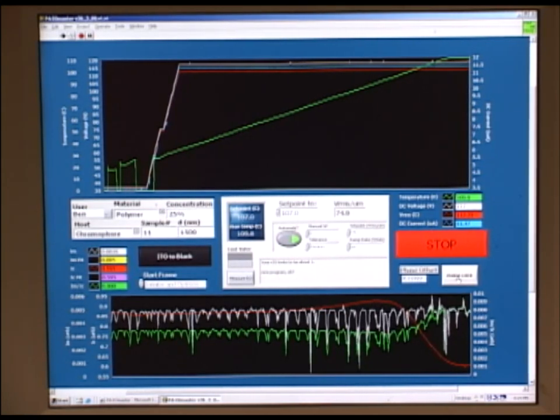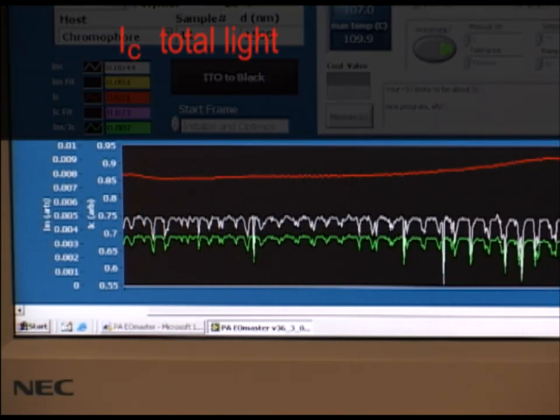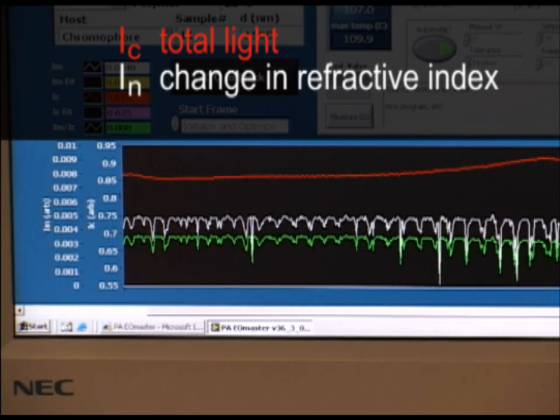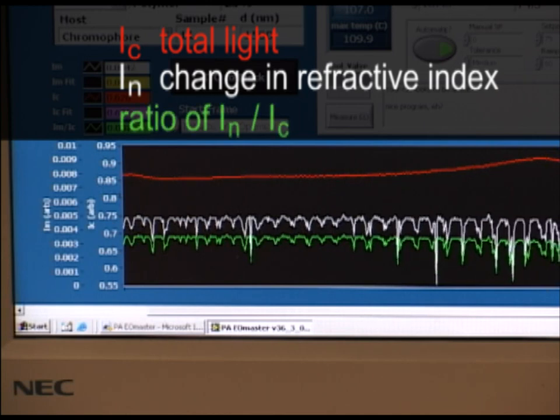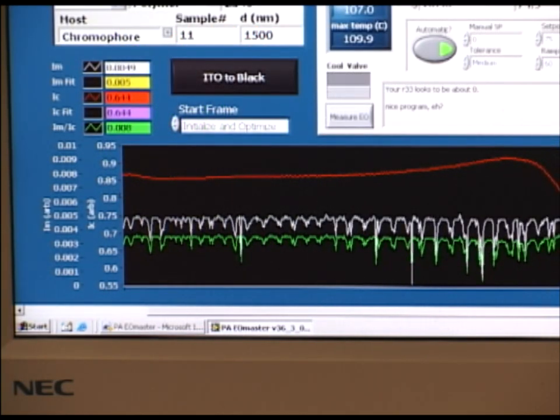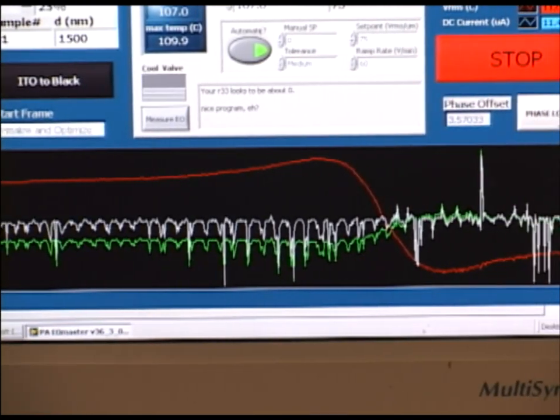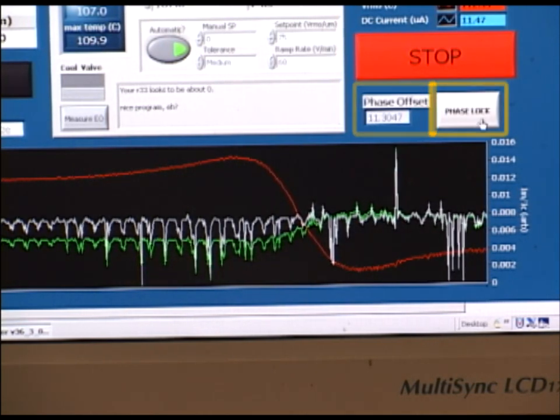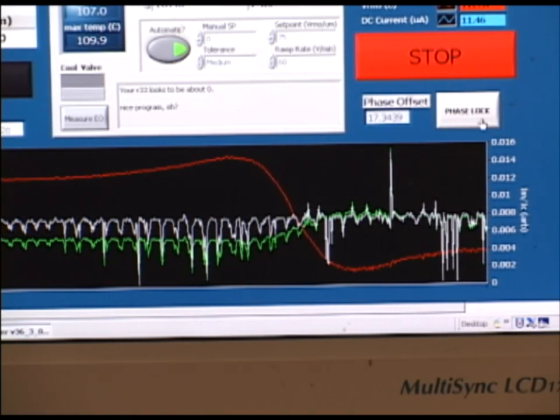Now that the set point temperature has been reached we can look at the optical data graph on the bottom. The red line represents what we call I sub C, which is total light incident on the photodetector. The white line corresponds to the refractive index changing as we induce order and it's labeled I sub M. The green trace is a ratio of I sub M over I sub C. It is important during the poling process to monitor the phase offset which is taken from the lock-in amplifier. In this case we can see a phase offset as high as 17 degrees, so we'll want to push the phase lock button which will command the lock-in amplifier to lock in on the AC signal coming from the photodiode.